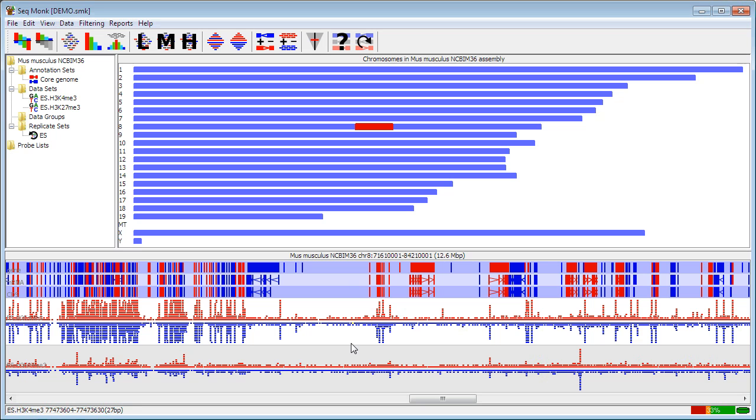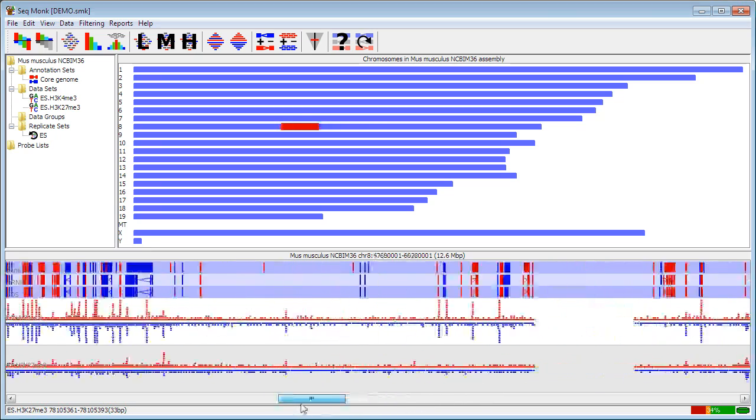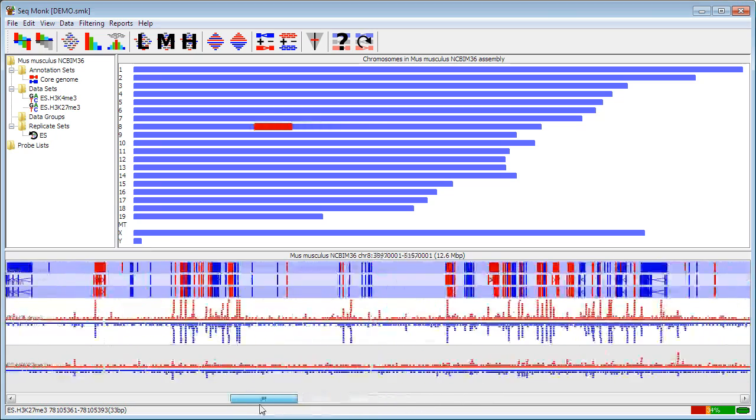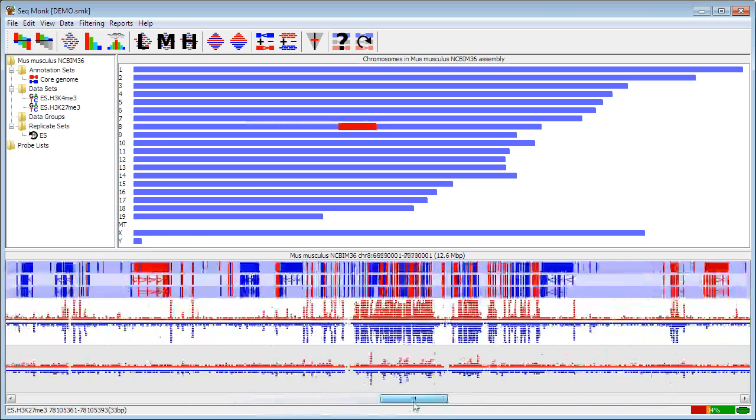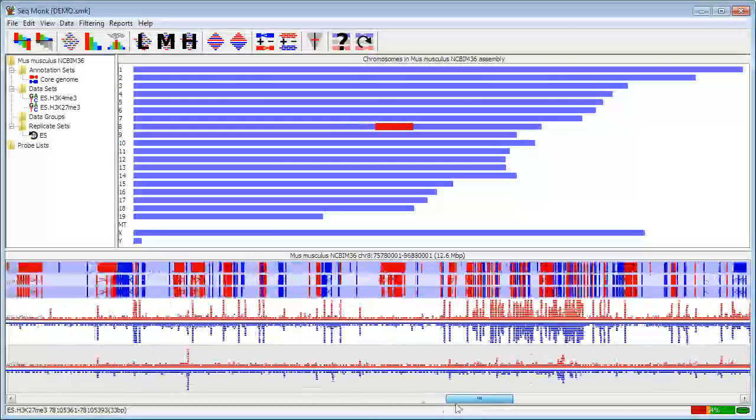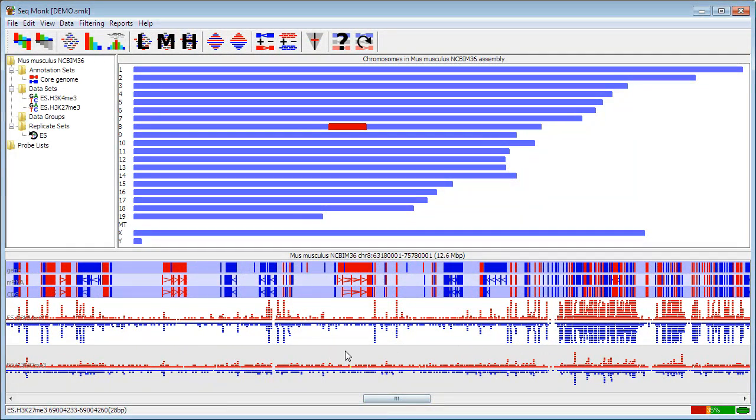Within the chromosome view I can move around either by dragging the slider at the bottom which will allow me to move laterally across the chromosome. Or I can move around by zooming in and out which is probably the easier way to do it.